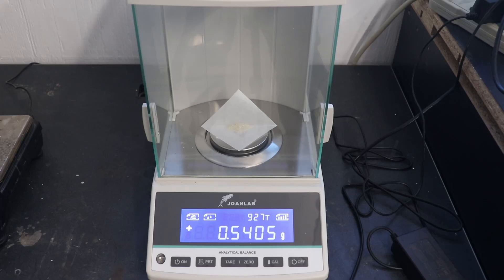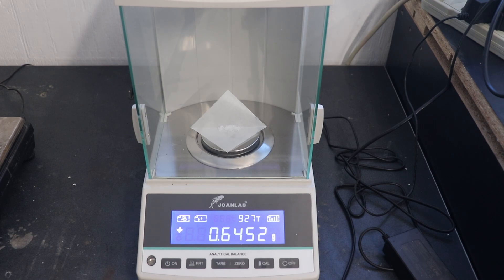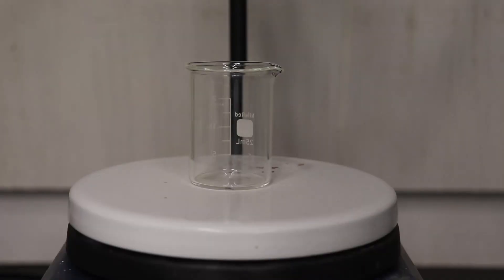To get started, I weighed out 540 mg of orthophenylenediamine and 645 mg of selenus acid. The selenus acid was dissolved in a minimal amount of distilled water.